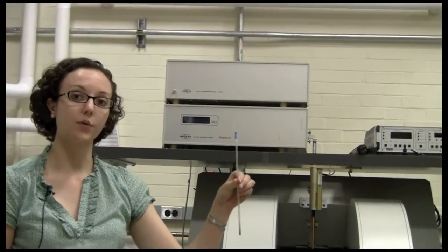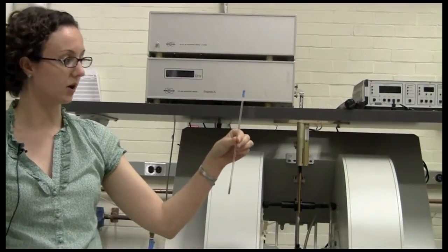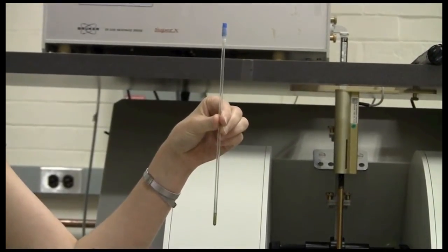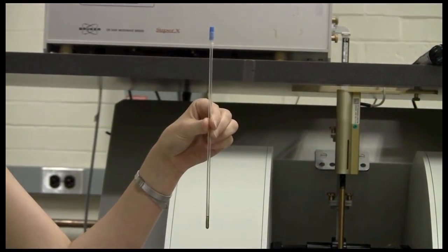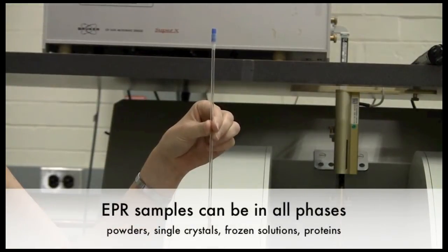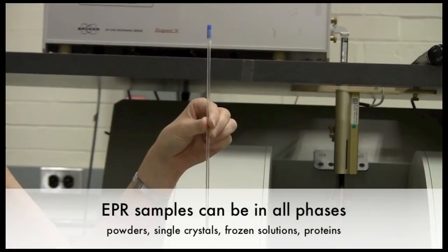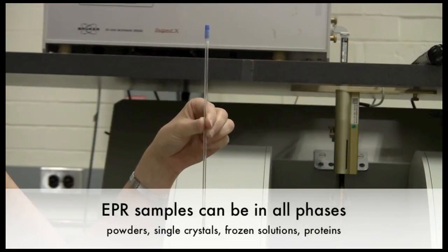The samples for an EPR spectrum are prepared in these long skinny EPR tubes that are made of quartz to remove paramagnetic impurities. EPR samples can be either liquids or solids or gases and can include everything from powders to single crystals, frozen solutions or protein samples.